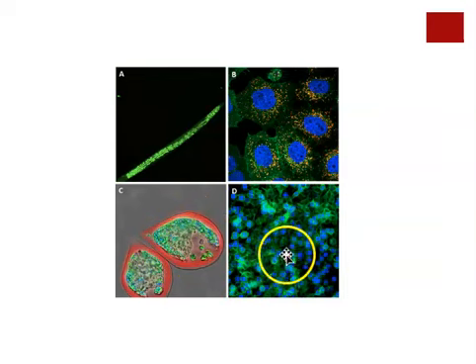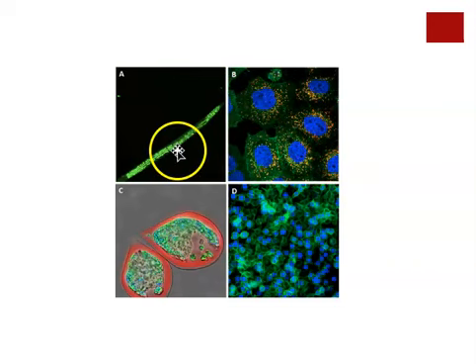Over here, again, you've got different colors, different tags. You've got blue and you've got green, again, binding to different structural components of the cells. Fluorescence is really amazing. It's very detailed. It's very bright, very obvious, the individual structures that are tagged in the cell.